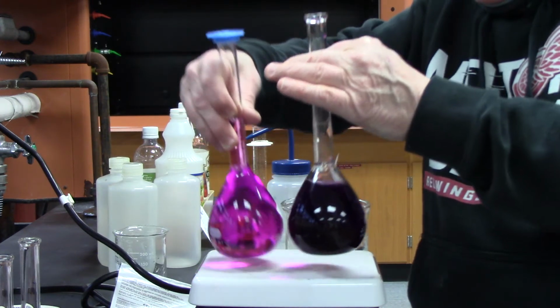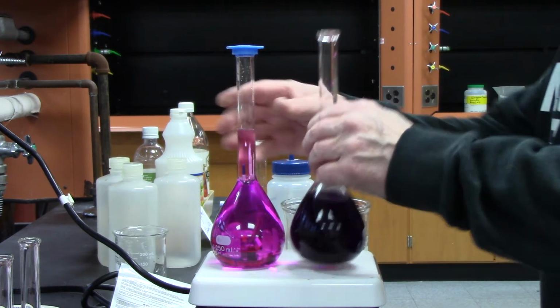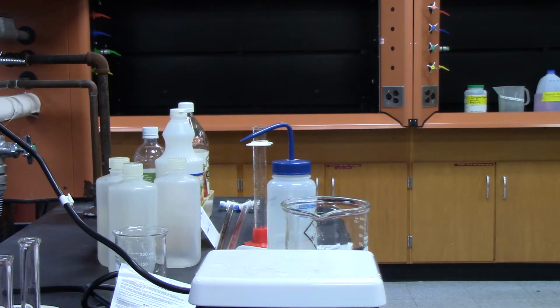If you look at the 2, you can see that they're quite a bit different in terms of their makeup. All right, so I have number 1, number 2. Now what I'm going to do is make up my dilutions. Number 2 is going to be used for 2 experiments, the first experiment and the second experiment. So it's 20 times 10 to the minus 4th. And from that, number 1, I mean, I made a mistake there. Or did I? No.